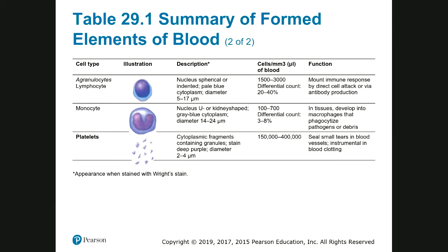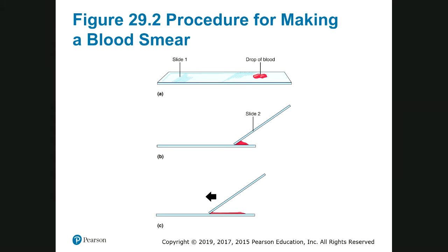So how can we see the histology of the blood? If we are in the lab, or if you have a microscope, slide and cover slip at home, you can do it, and you can look at your own blood smear at home. But first you have to wear gloves and take all the precautions possible.